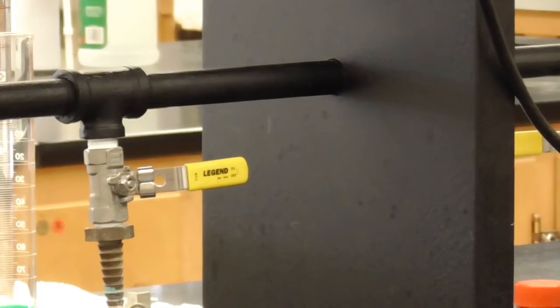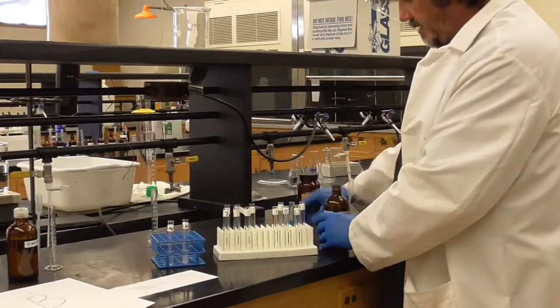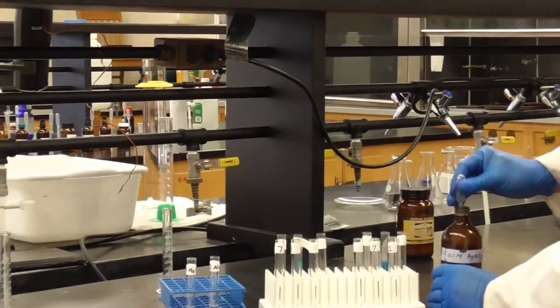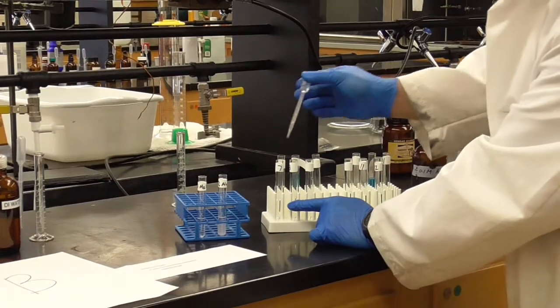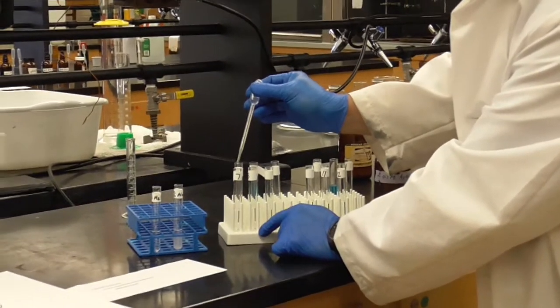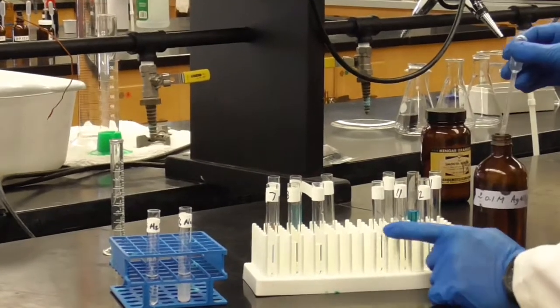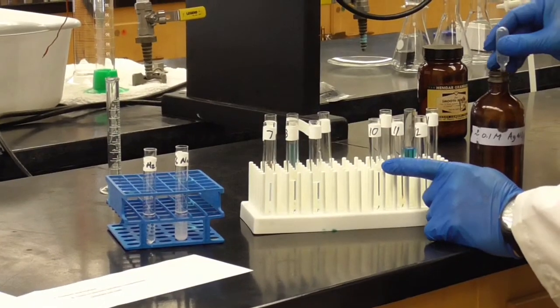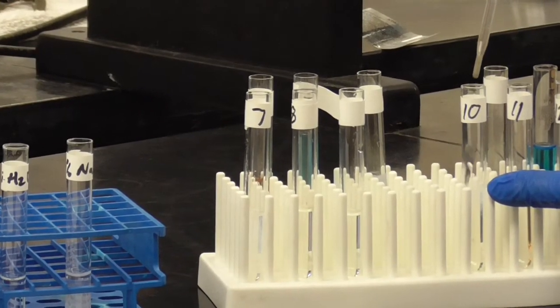All right, and our usual test, first for the chloride test using the silver nitrate. We'll do that in the first test tube of each set. Add a couple of drops. So here we go, we watch down here. I add 1, 2, 3 drops here, and then we'll do the same thing on the first test tube from inside of the bag. 1, 2, 3 drops there.